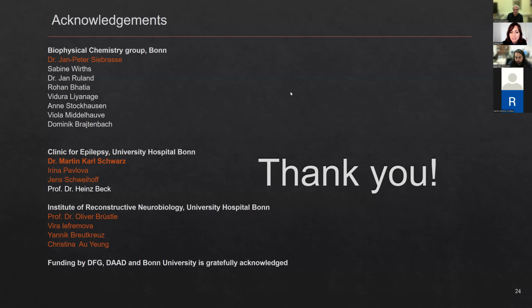If anybody has questions, please go ahead. I think you can unmute. Oh, here's one, Ignacio. Yes, thank you, Lenka. Very nice talk, Ulrich and Juan Eduardo. I'm not familiar with light sheet microscopy, so I'm wondering if it's always necessary to do this expansion of your sample.